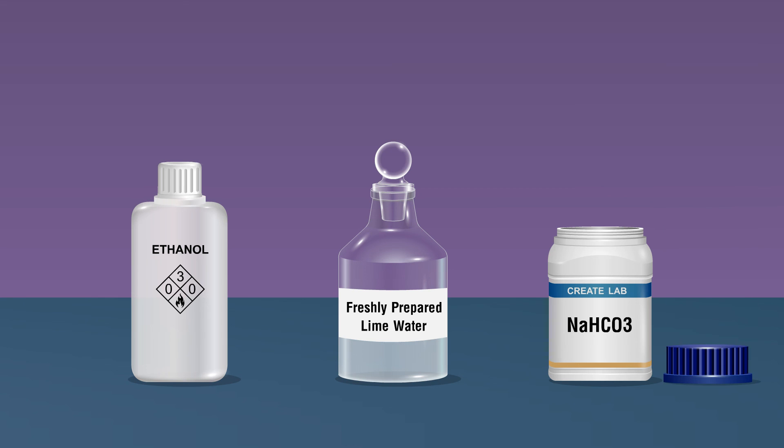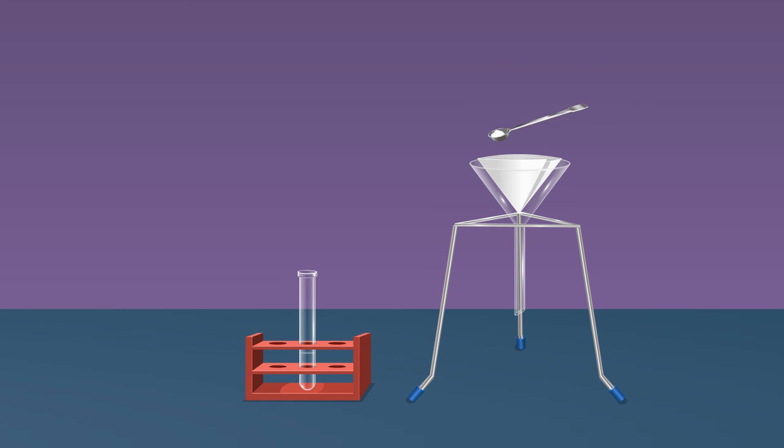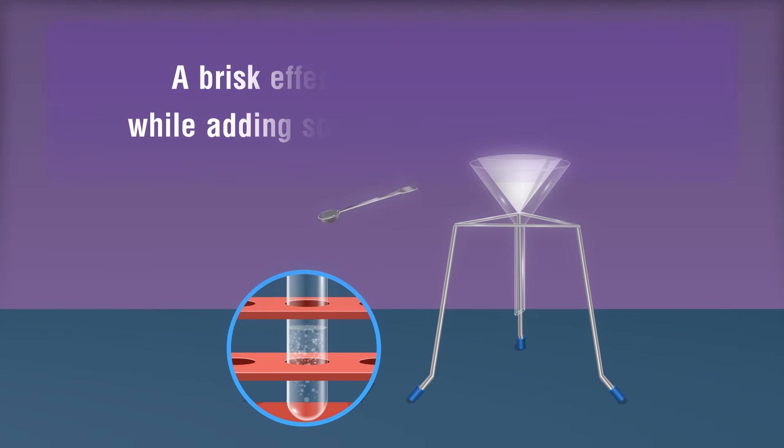Then add a pinch of sodium hydrogen carbonate NaHCO3 using a spatula into the boiling tube containing the filtrate. A brisk effervescence is produced while adding sodium hydrogen carbonate.